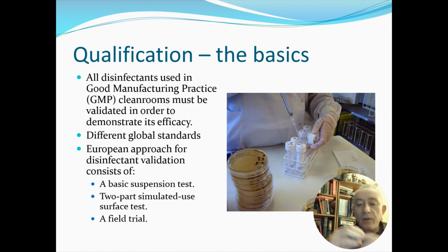For the user, then surface or coupon tests are very important, and this requires the application of microorganisms to the different surfaces, for the chosen concentration to be used, to measure the contact time, to then prevent any further activity through neutralization, and then assessing the number of microbial survivors and determining whether that is appropriate for the particular application.